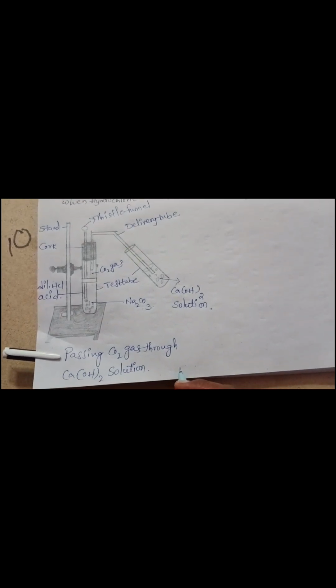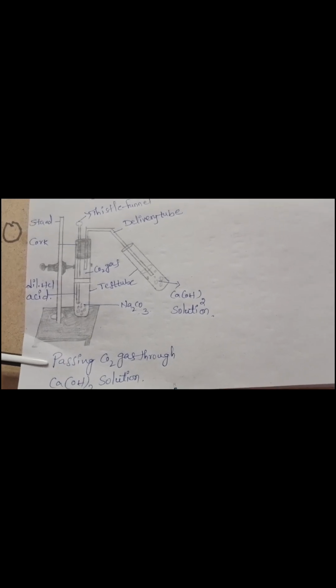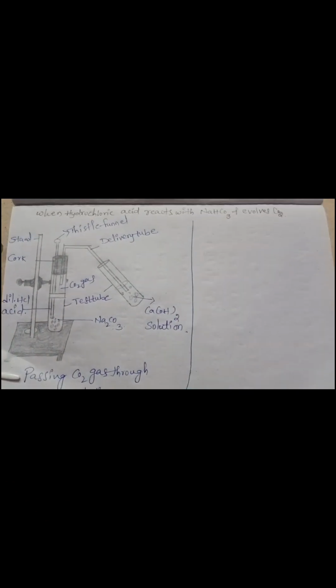Today we are going to discuss the reaction of carbonates and metal hydrogen carbonates with acids, which produces carbon dioxide gas. When hydrochloric acid reacts with carbonates and metal hydrogen carbonates, it evolves carbon dioxide gas. For this activity we need some materials.